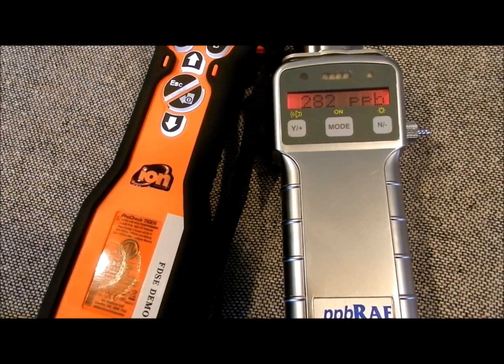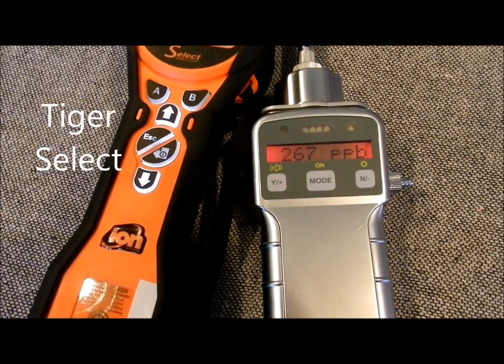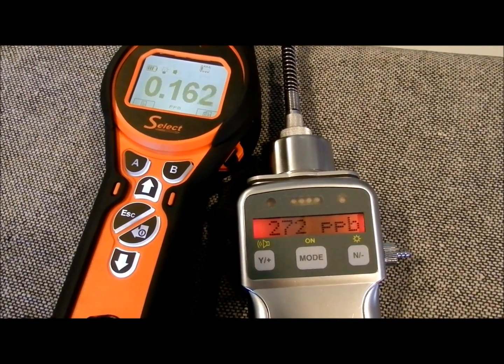This video shows the difference in response between the PPB Ray and the Tiger Select operated in TAC mode, reading PPB levels and the effect of water vapor on these two instruments.